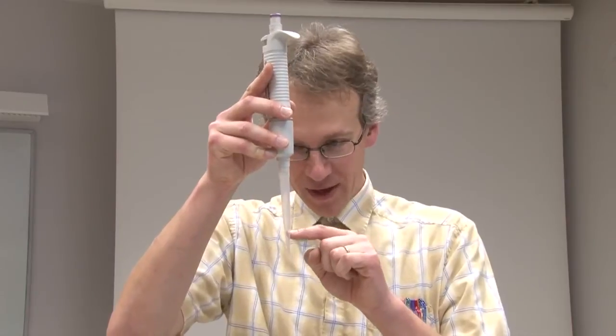As with glass pipettes, it is important with automatic pipettes that the liquid being pipetted is similar to the one with which the pipette was calibrated. As long as you pipette dilute aqueous solutions, all is fine. But if the pipette is calibrated with water and the solution pipetted is a concentrated salt solution or concentrated alkali or acid, quite significant additional uncertainty can result — largely because of the density difference between the liquids. The density difference will cause less liquid to be held in the pipette tip, as a slight vacuum forms and part of the liquid falls out before you remove the pipette from the liquid.